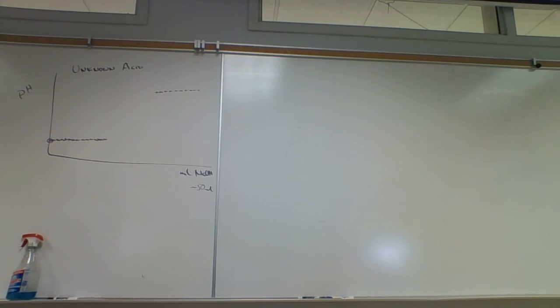And so we can't afford to have that. And so what are we going to do? Well, what we're going to do first is we're going to do a sacrificial titration. That is, we're just going to do something called a trial titration, in which we are not going to measure pHs. We're just going to use phenolphthalein as the indicator, where the equivalence point is.